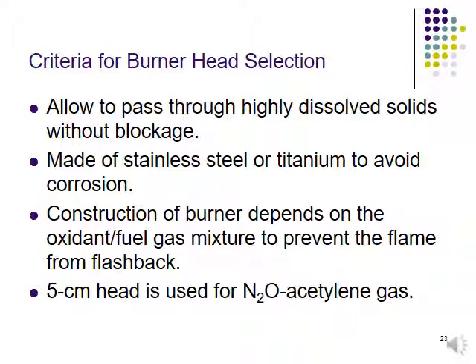Okay, this is the reason why we need to use a very stable element as our burner, because at high temperature or very high humidity, we can avoid the corrosion from happening.